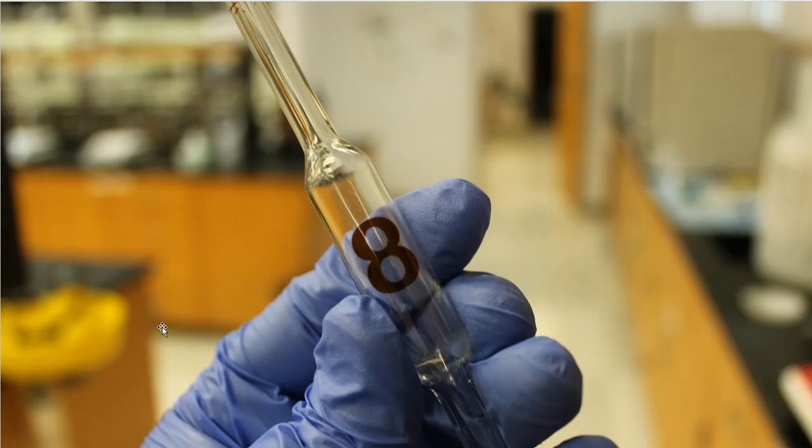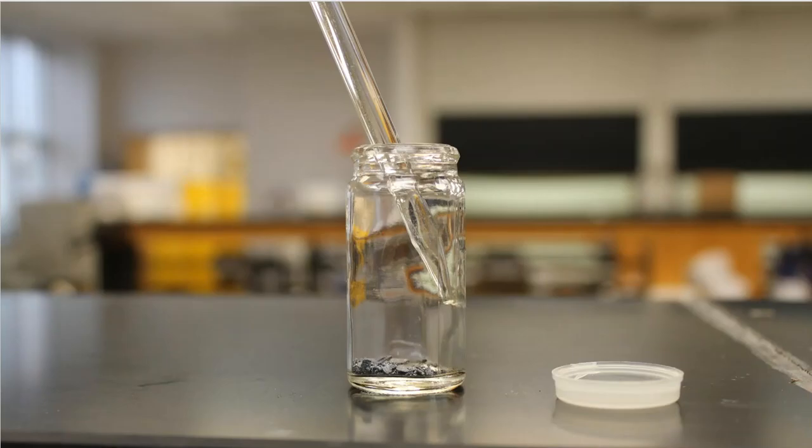It tells me to measure out 8 milliliters of THF. I go to my lab drawer and get this volumetric pipette. We do have volumetric pipettes for 8 mL, so that's what I brought out. I stuck it down into my THF and sucked the THF up until the bottom of the meniscus reached this marking line at the very top. Then I transferred that THF into my container that has those iodine crystals in it.